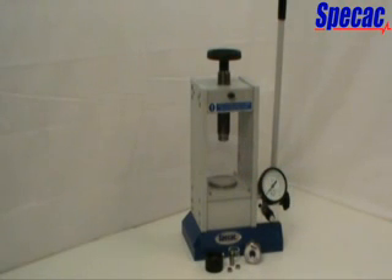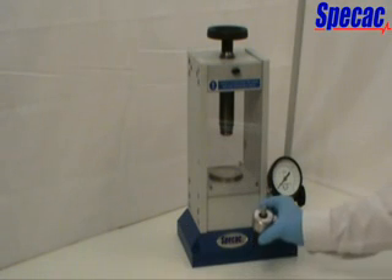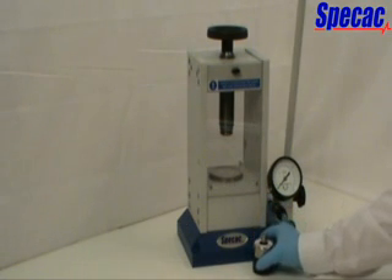When resistance is offered by a sample, the pressure build-up in the system is shown on the 15-ton load gauge located on the pump block assembly. For a typical pressing of a sample, we are using the 13mm die assembly as an example of work to press.